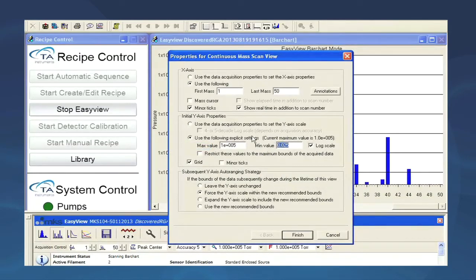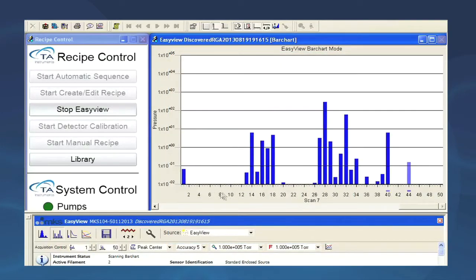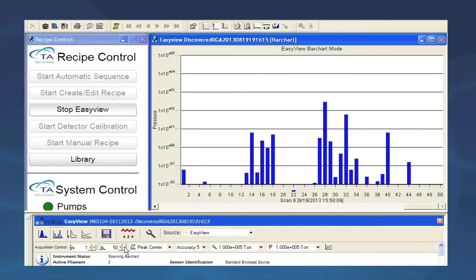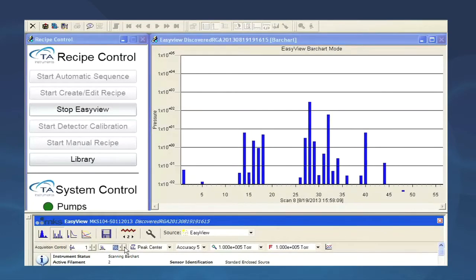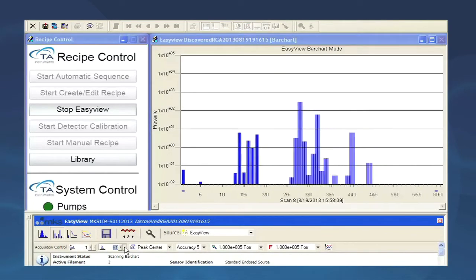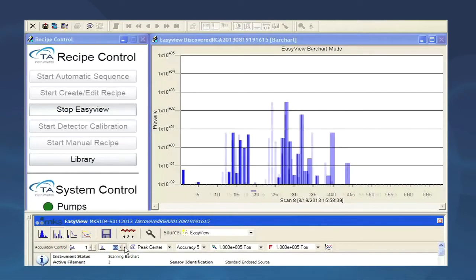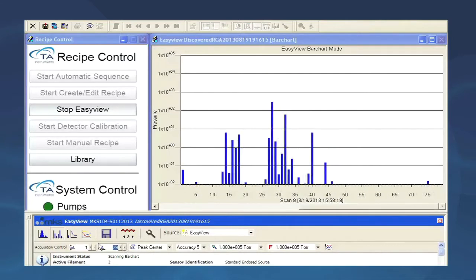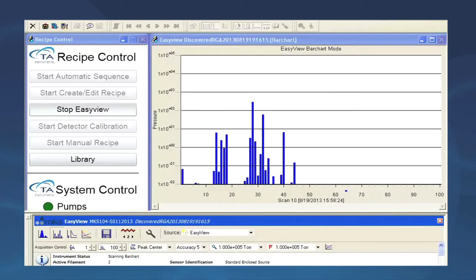Set the threshold for where you expect to do your analysis. We have 1 times 10 to the minus 2 entered here. The ion mass range can also be changed by using the arrows to increase or decrease the range. You can also simply enter a number in the box for the upper limit. Now we are scanning from mass 1 to 100 atomic mass units.